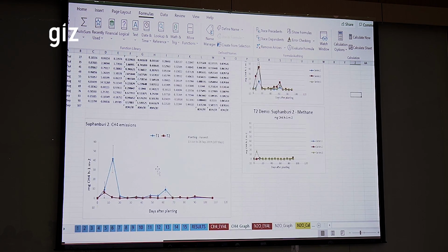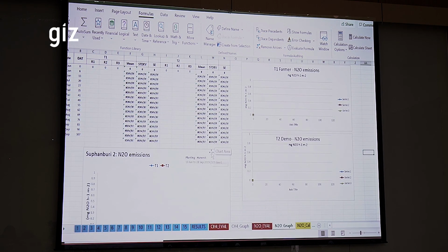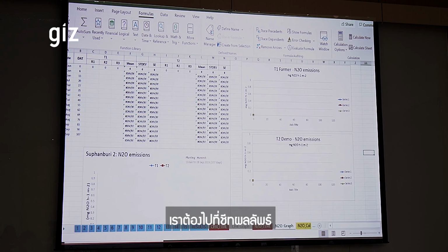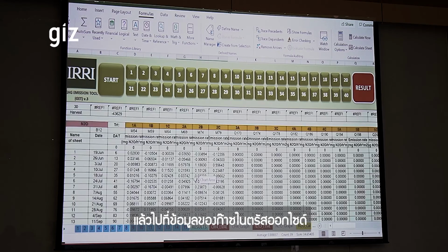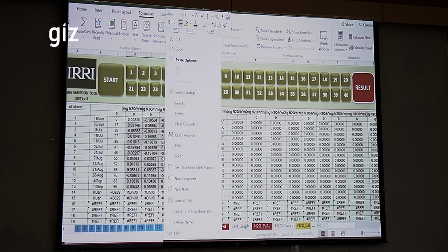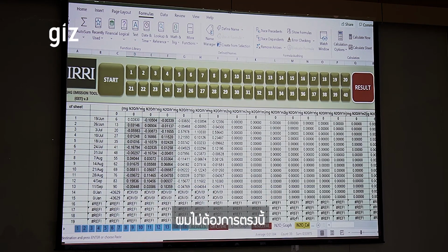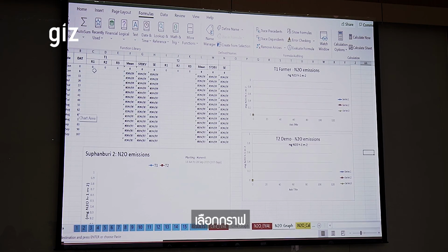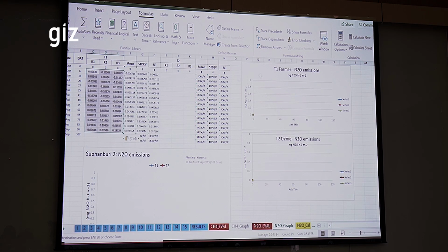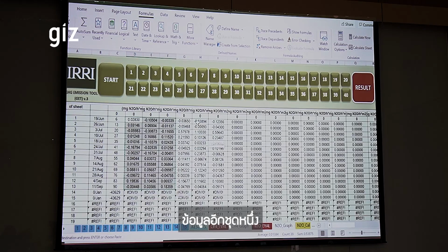Okay. So if you look at, if we populate now, I do it for the nitrous oxide also. So we go to the results sheet, go to the nitrous oxide, copy. I don't want that. So graph, copy in, and go back. The other one.